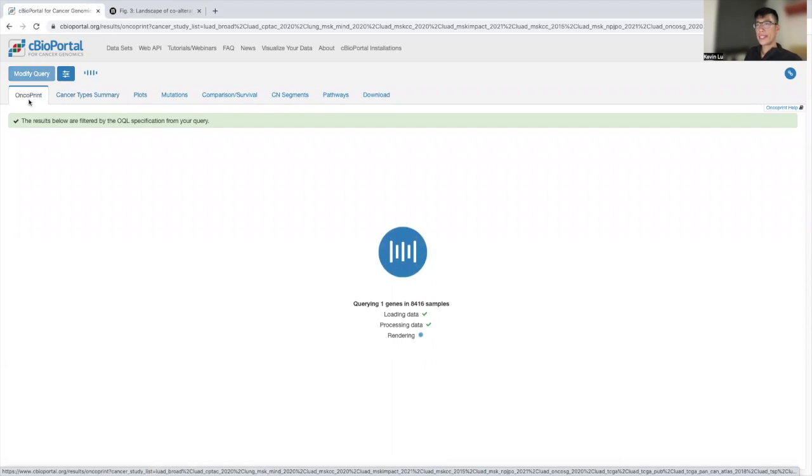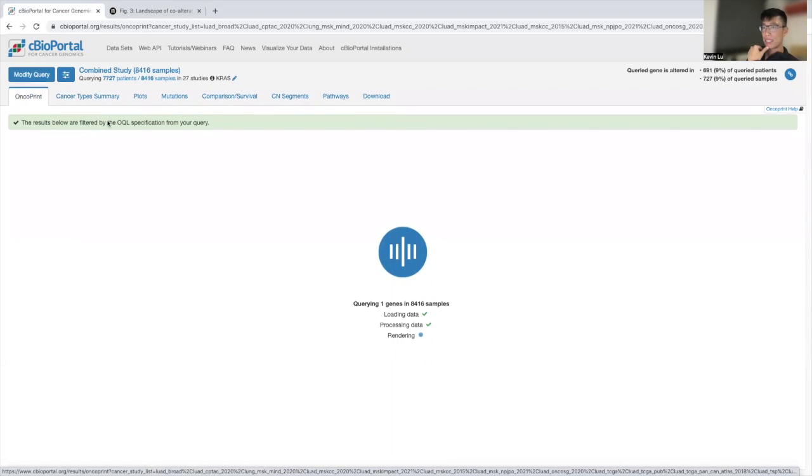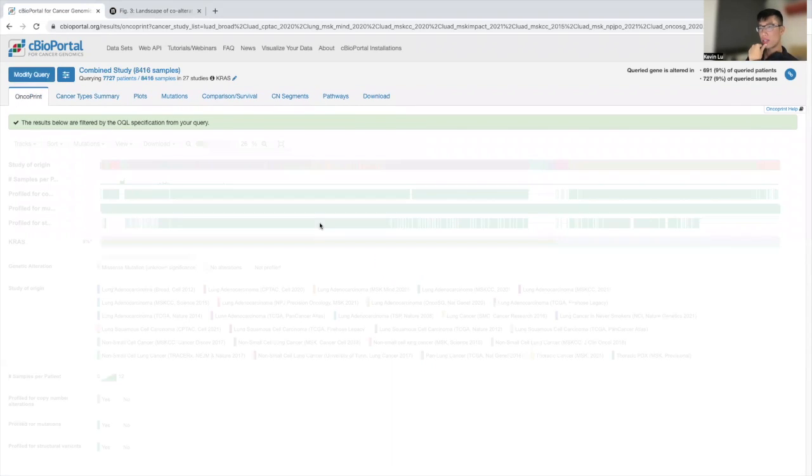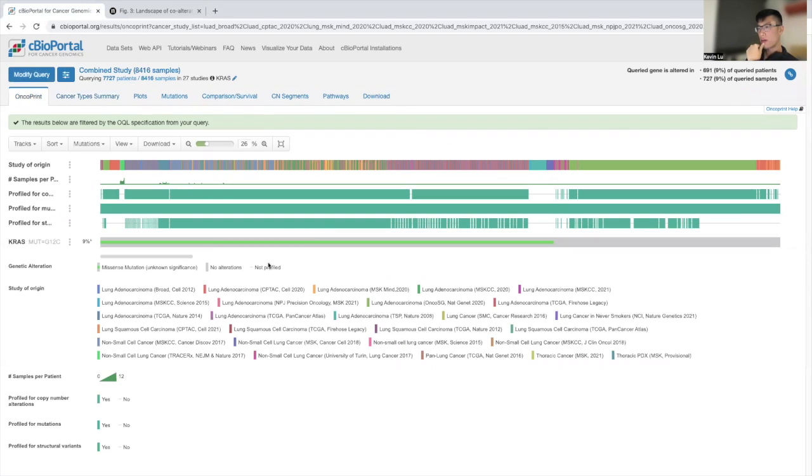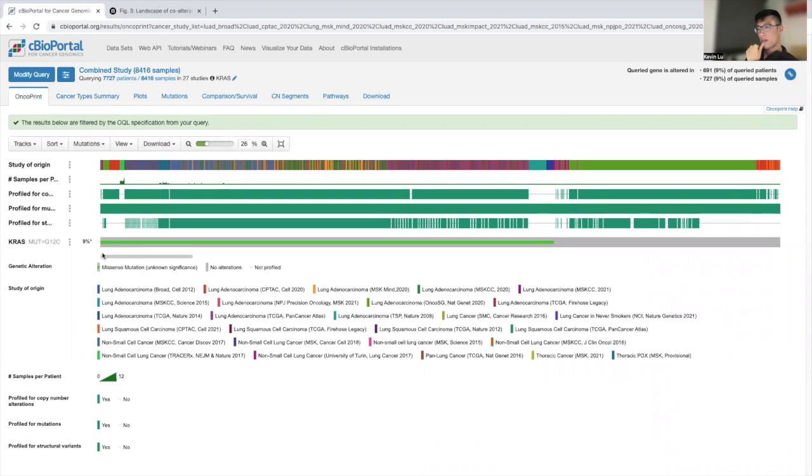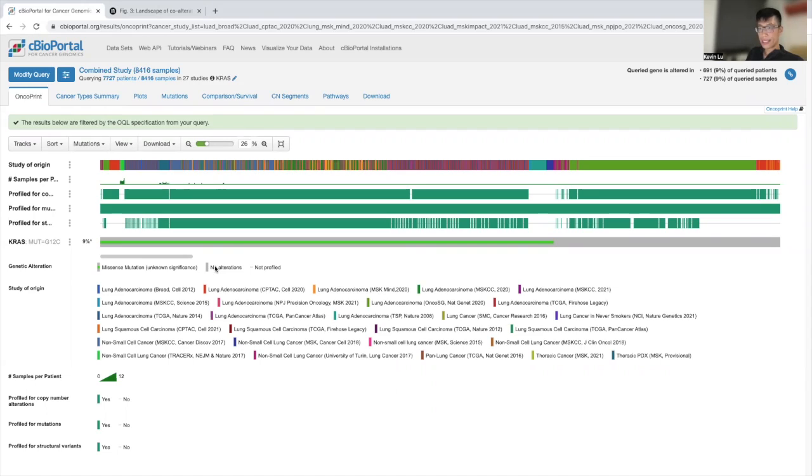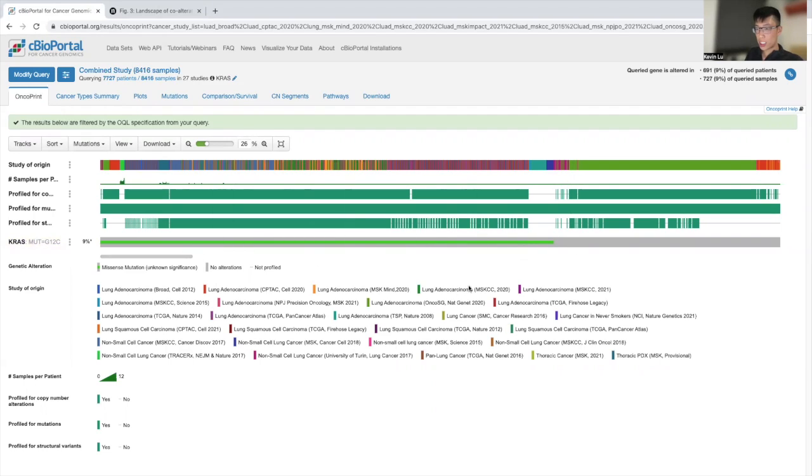And we're going to hit the oncoprint tab. You can see on this oncoprint, there's 9% of patients, at least within all these studies, that have a KRAS-G12C mutation. So we want to capture all of these patients into one study so we can look at the co-alterations specifically associated with this cohort of patients.